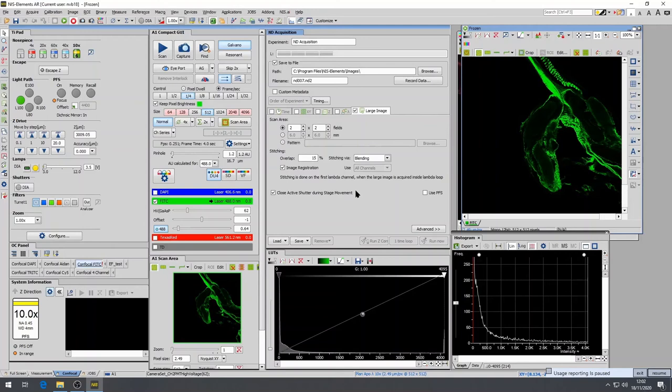When you have set up the mosaic, ensure that the checkbox next to the large image and the lambda on the top row is ticked. This will activate the Run Now button and press Run Now to capture the image.